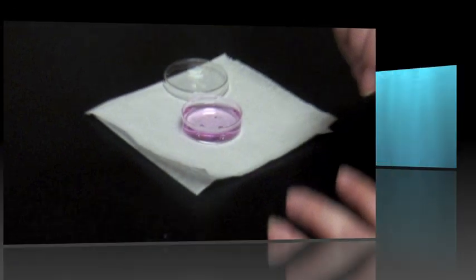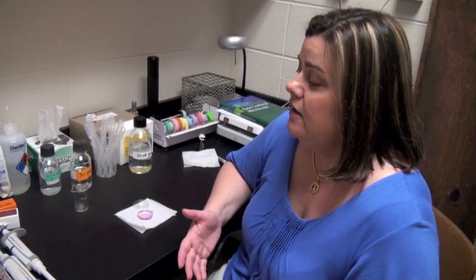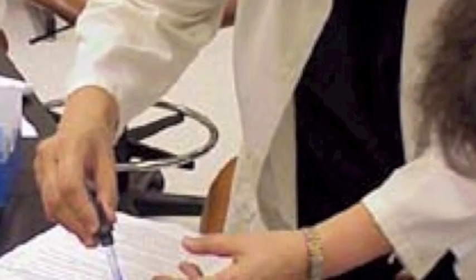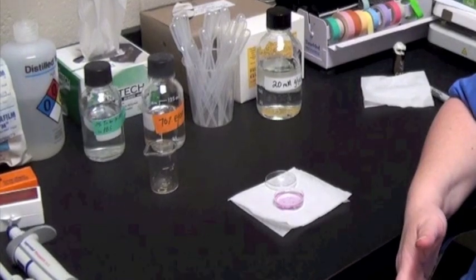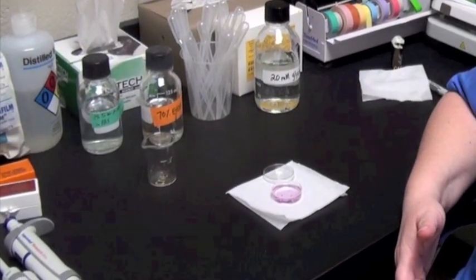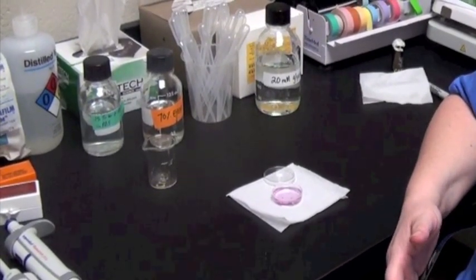An ideal fixative would be something that preserves the three-dimensional architecture of your sample and protects it from light. It's not going to be easy for all fixatives to accomplish everything that you want, so there's no real perfect fixative, but there are some that are better than others and some that are better for different types of microscopy.